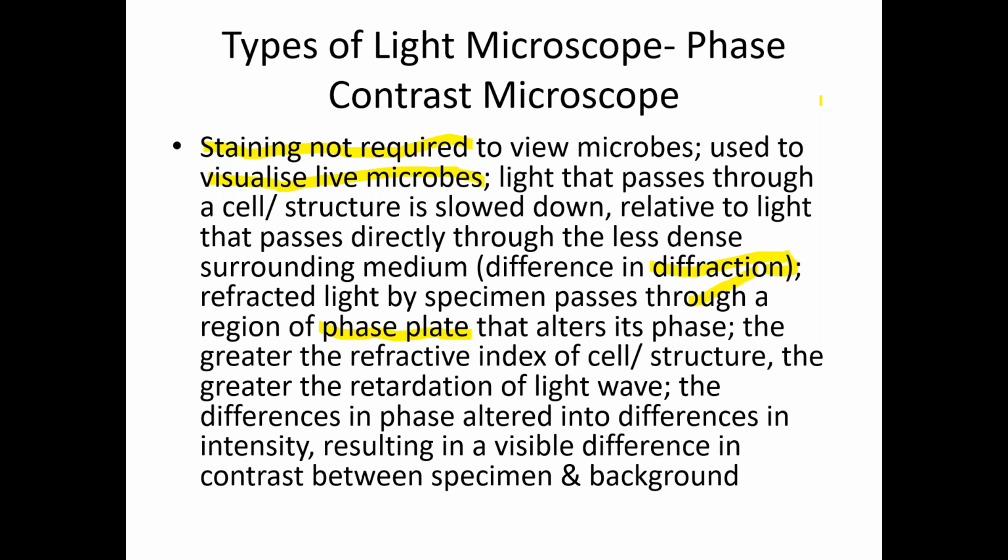This refraction or diffraction is converted into a phase change, which alters its speed, by the special structure called the phase plate.